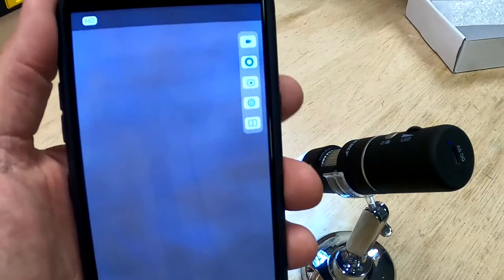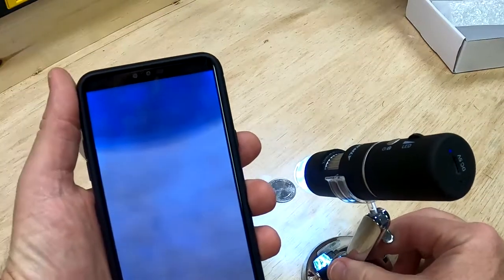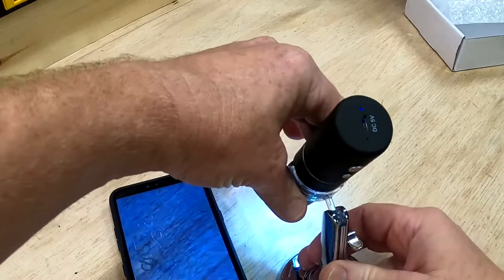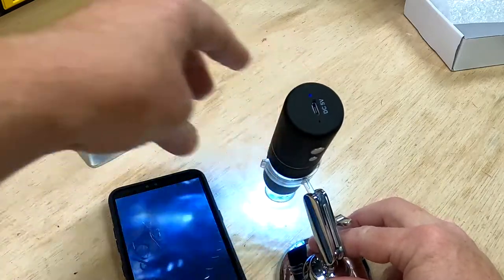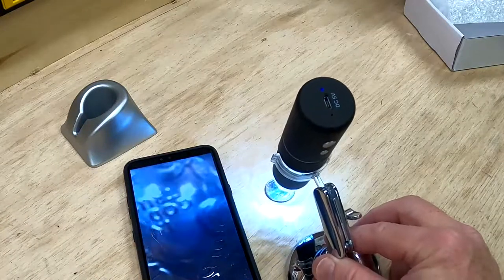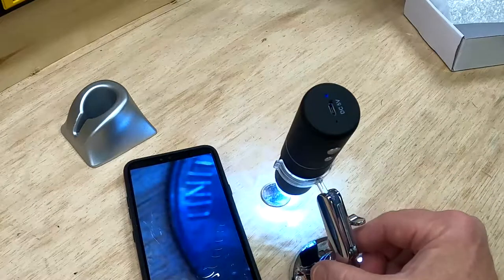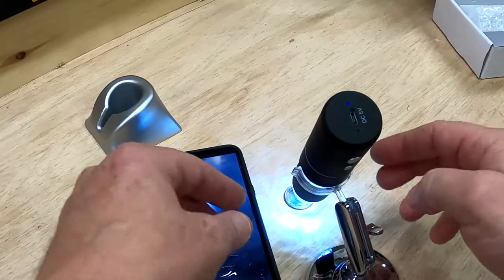I'm going to keep my phone in the image while I put a quarter underneath the microscope, and we're going to look at George Washington up close. Bear with me while I zoom in. One thing to note: everything you look at is reversed — the image is flipped upside down. There's George Washington's nose right there.